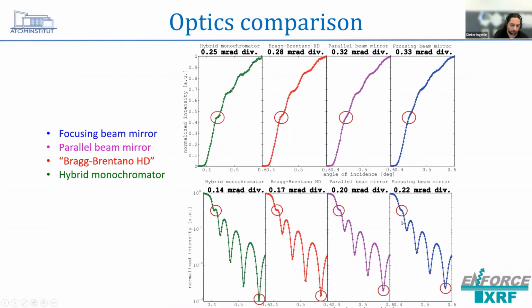So, I mean, in this case, it's not that much of a problem because it's just one layer, so we can still analyze it maybe with the highest intensity mirror, but for more complicated layer structures, it's quite helpful if you have maybe some better resolution option.